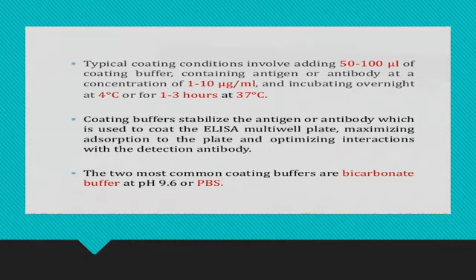طبعا وين نسوي له incubation؟ قسم experiment is fine doing it at room temperature، يعني leave outside أو نحطه بالكابينت أو نحطها some experiment they work better when the incubation is at 4 centigrade يعني بالفريج. Coating buffer stabilize the antigen or antibody which is used to coat the ELISA multi-well plate, maximizing adsorption.